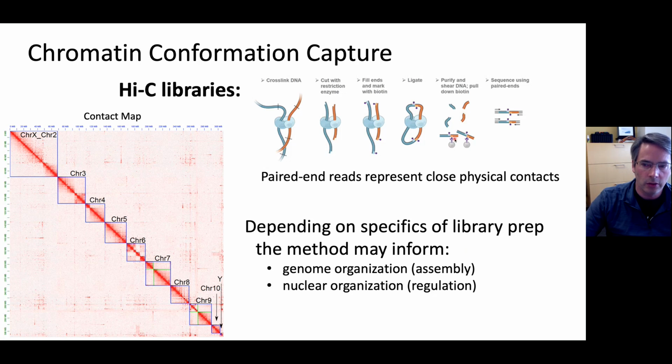The idea, though, is that these things must have been close together, and so when you do those reads, you get, and remember, we're collecting billions and billions of these, you could call them proximity indicators, and that goes into a graph like this, where the contact map is showing the number of times that this purple and orange showed up in the same Illumina fragment.